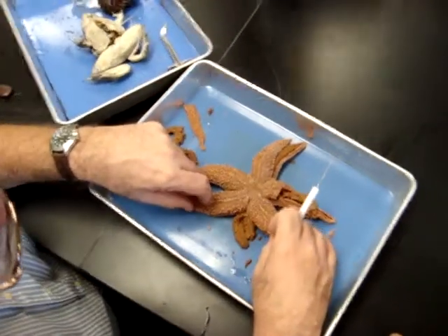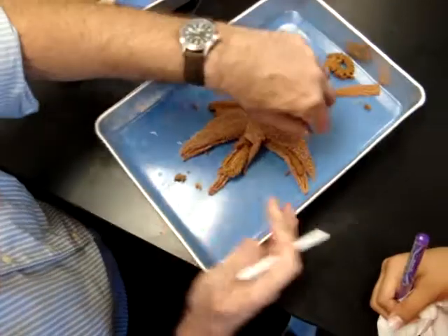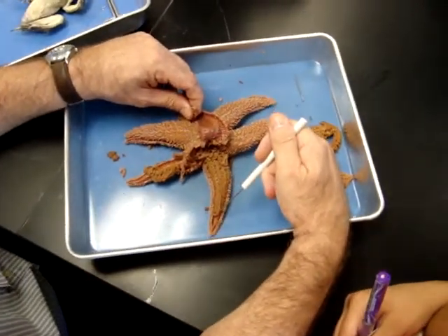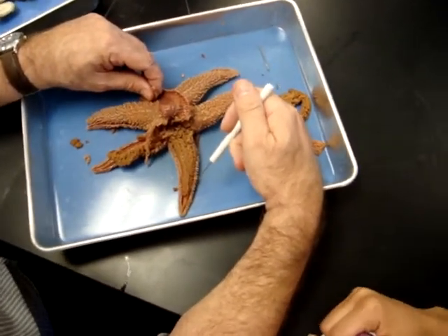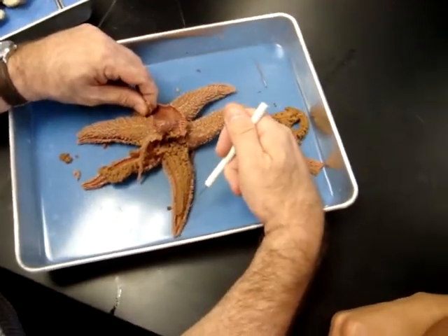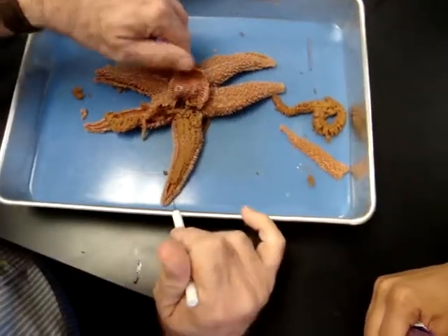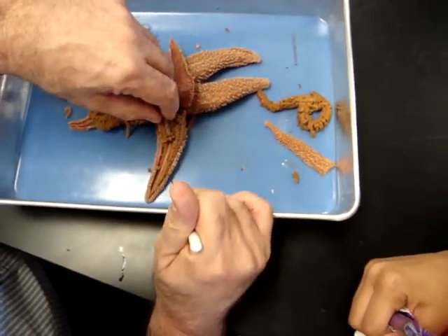Arms. Each of the appendages has exactly the same thing in it. Okay, so we'll pop the top. How cool is that? This segmented structure is called a pyloric cecum or digestive gland. Now, on a lab practical, I might say, give me the technical term for this, because don't just memorize one thing. You know, this is a class of lots of synonyms. So you have to know pyloric cecum, also known as the digestive gland. And when I lift this up, there's going to be another structure you are responsible for.